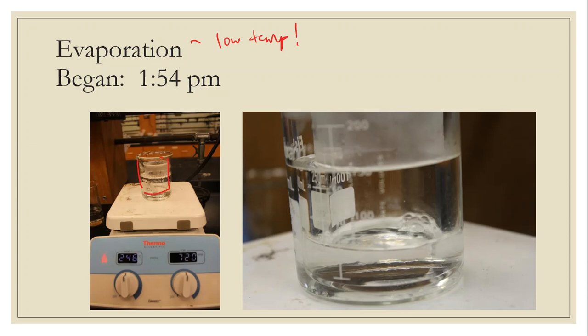So hot water bath in the beaker. I've put that beaker on a hot plate. I've turned it up about halfway. And then I see an inner beaker, and the inner beaker is my methylene chloride with the alkane. Now, the methylene chloride has a boiling point that is super, super low. And the alkane, depending on whichever one I have, has a boiling point that is very high. Okay, it's 100 or more. So there's a big drastic difference here.